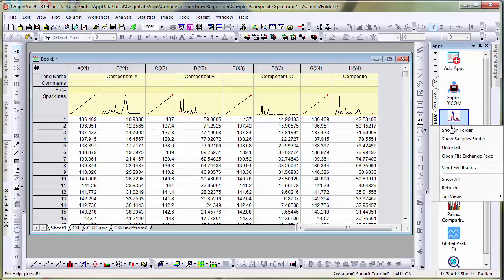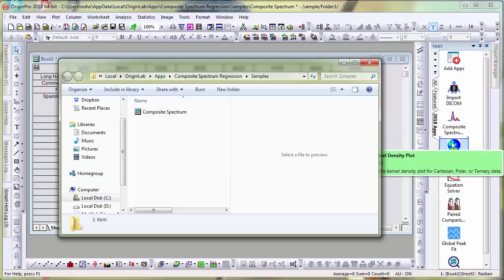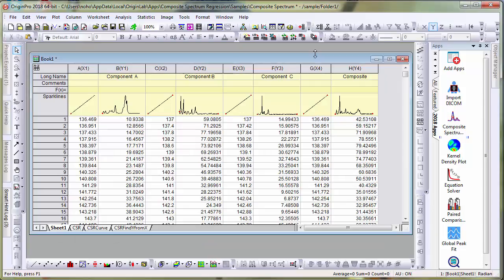The app ships with the sample file. You can open the samples folder by right-clicking on the icon and choosing the show samples menu item.